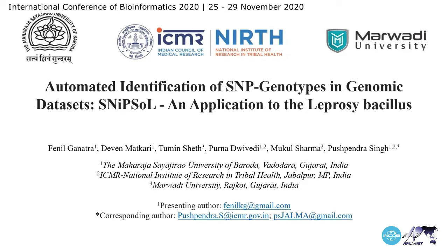And what we've done is we've made a program that can tell the user what strain of the leprosy bacillus they're dealing with based on just a few inputs of SNPs.